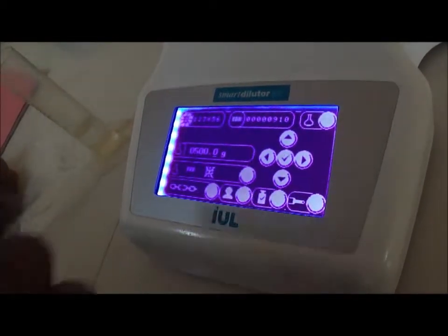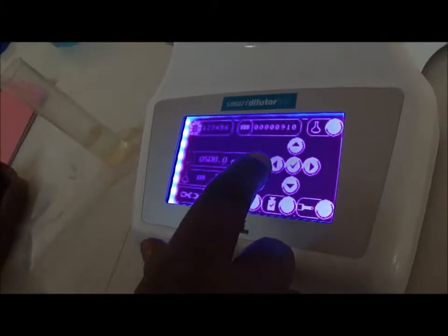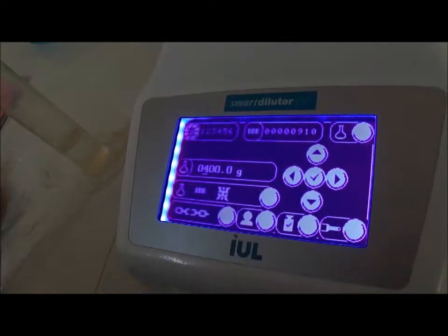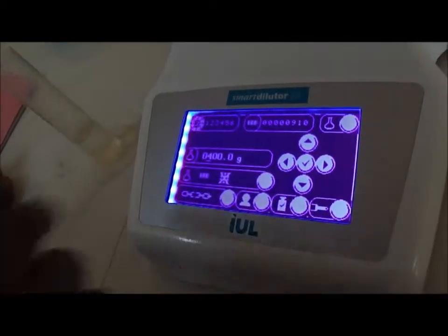This is changed here. If you make V here, then you can change it. For example, this was 500. I can take 400. And then I click OK.